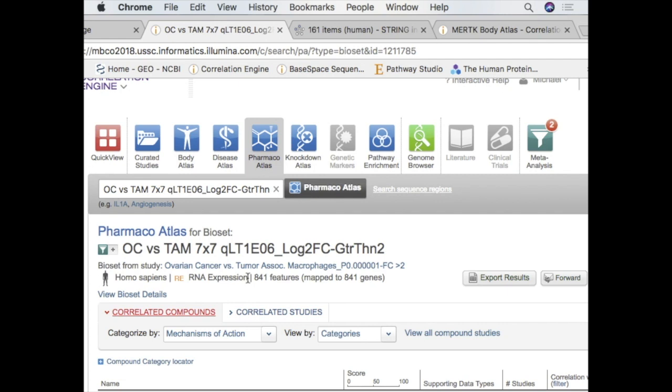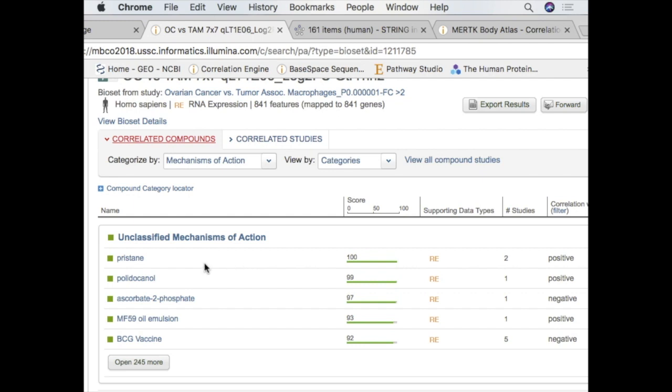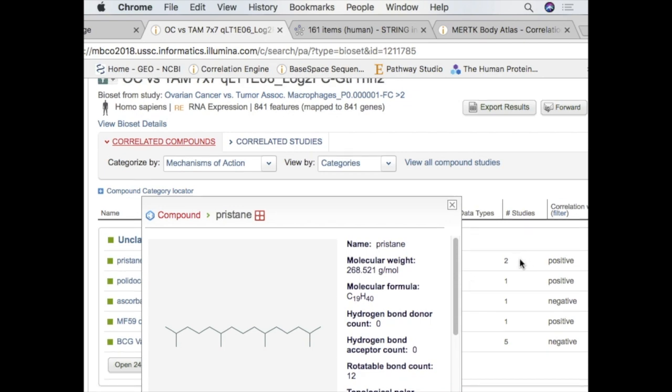And it's going to allow you to do better experiments because it's kind of like getting the Cliff Notes before you even go in there, right? I should expect this. I might not know exactly the details, but given all this transcriptome data, I would expect this. So I'm going to inhibit this, right? Okay, so that's Pharmaco. And again, you can click on any of these things and look them up, look at the studies, download all those genes that are common.